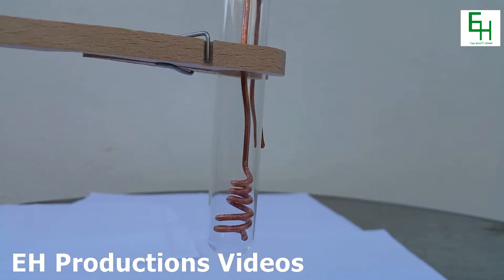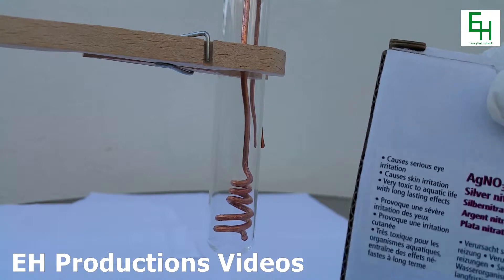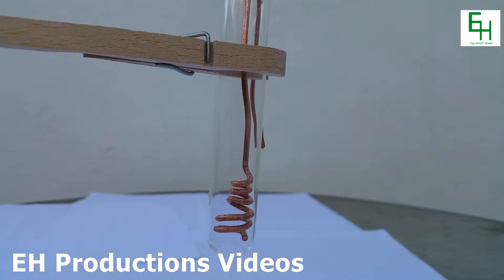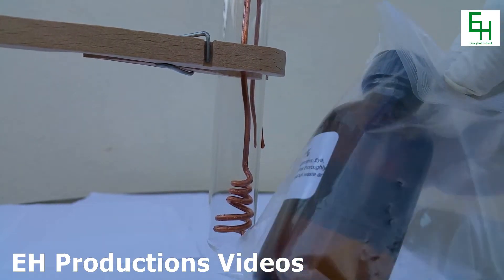Next, we're going to carefully get some silver nitrate solution, and I'm going to use a pipette to put it in. Here it is.